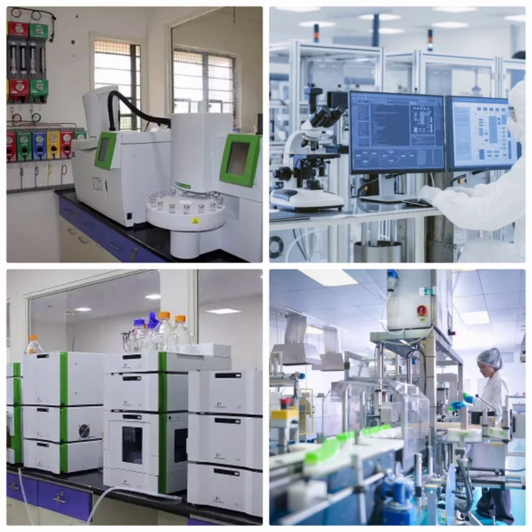Gas chromatography and high-performance liquid chromatography are both separation techniques which have gained immense popularity in both academic and industrial laboratories. High-performance liquid chromatography has found favor in applications covering pharmaceuticals, food, life sciences, and polymers, whereas gas chromatography has significant applications in the petroleum and petrochemical industry, flavors and fragrances, as well as environmental air monitoring.